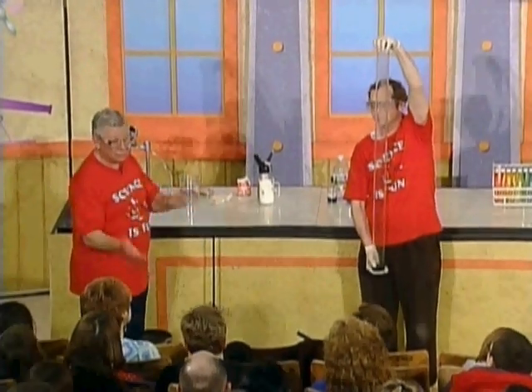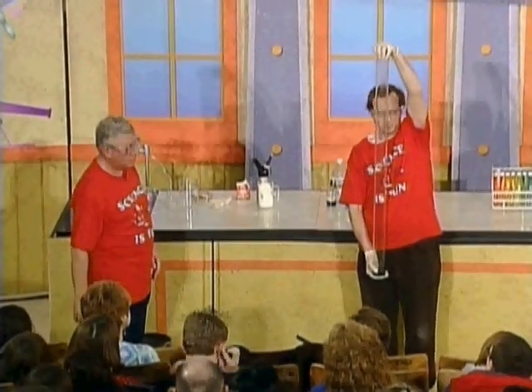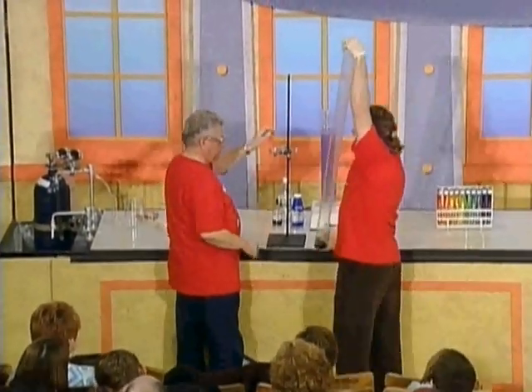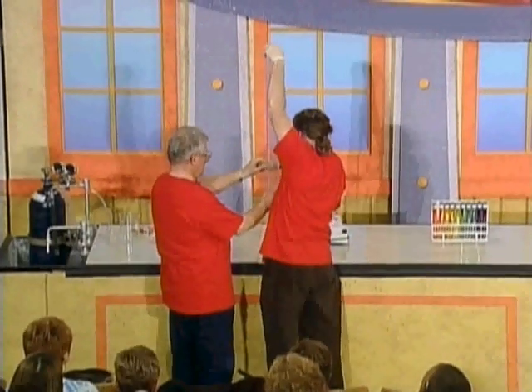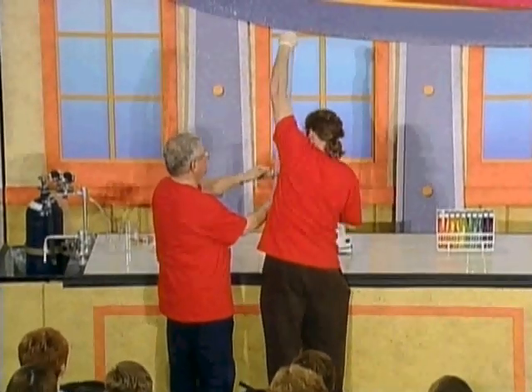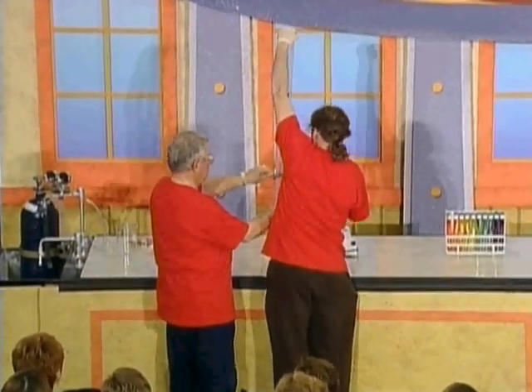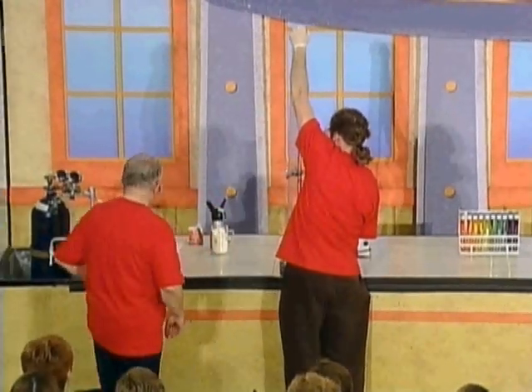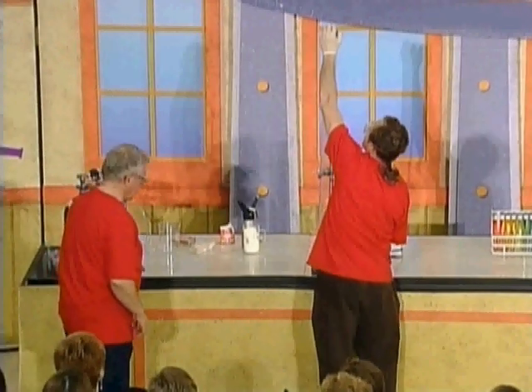Jim has mixed the N2O and carbon disulfide together. Now we're going to put this up here and clamp it.